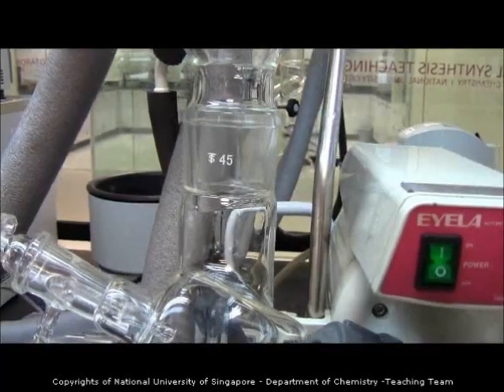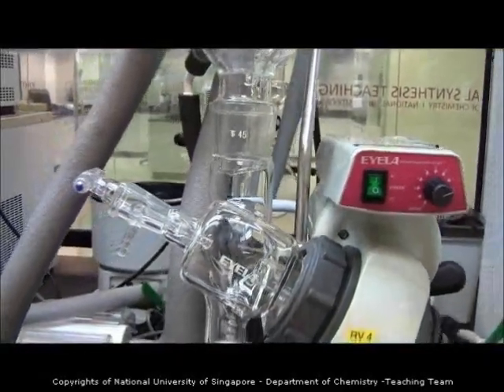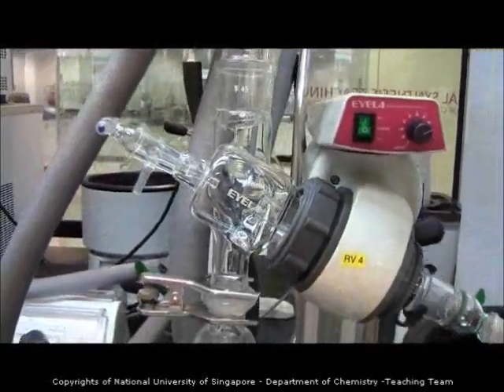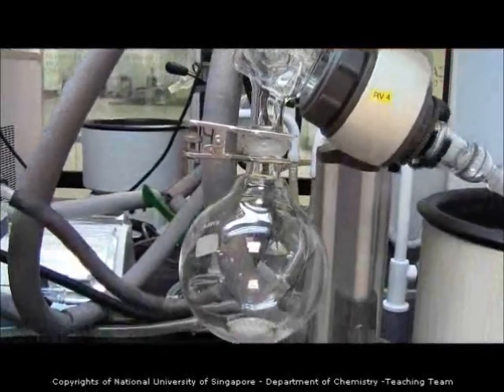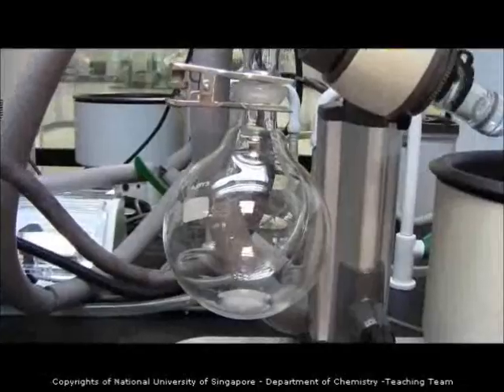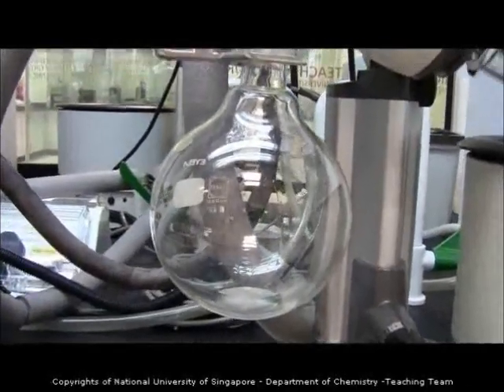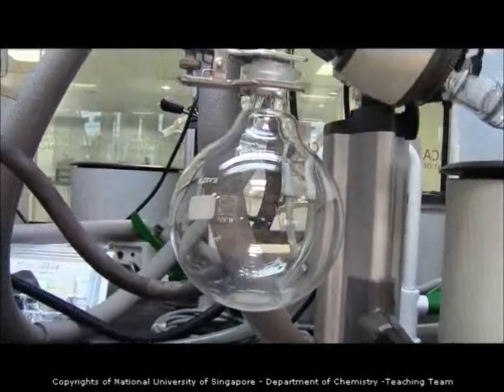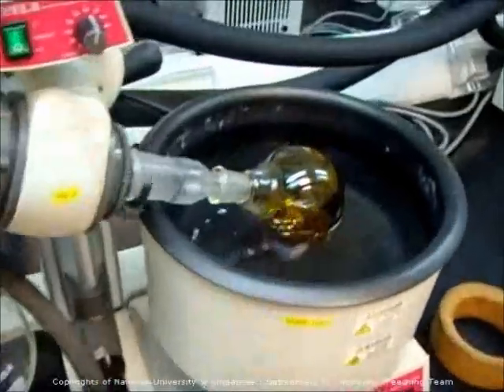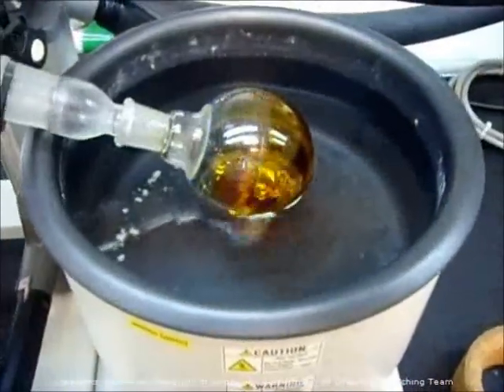After some time, you will notice that there is some liquid going down from the condenser into the receiver — that is your solvent. You will also see some bubbling inside the round bottom flask, which shows that the solvent is vaporizing.